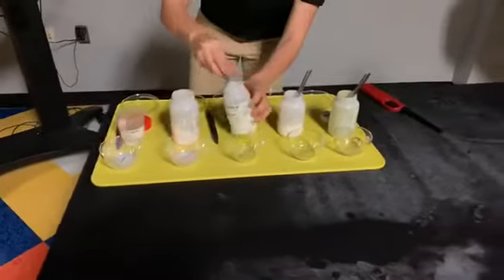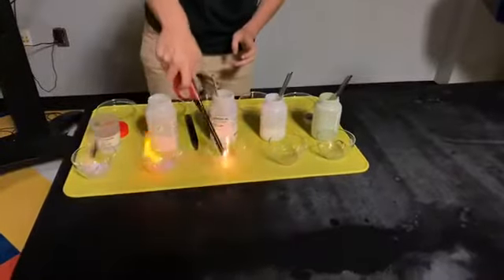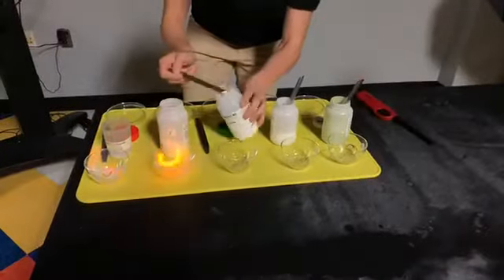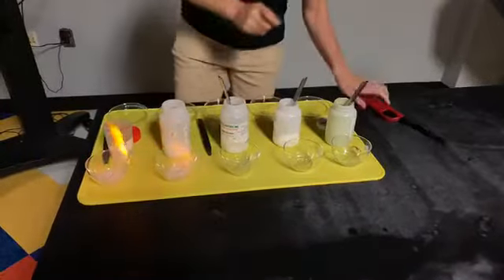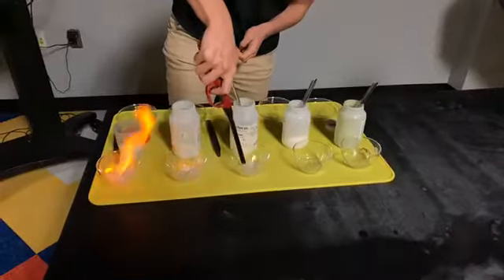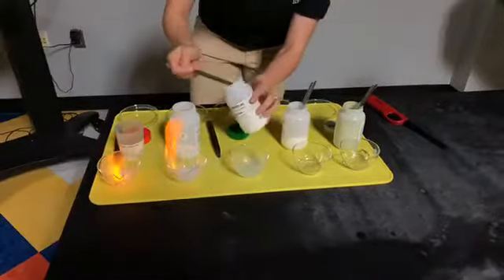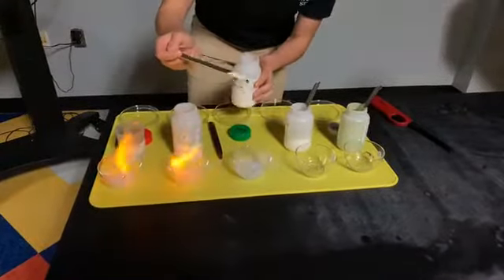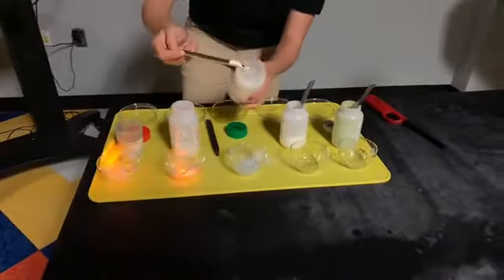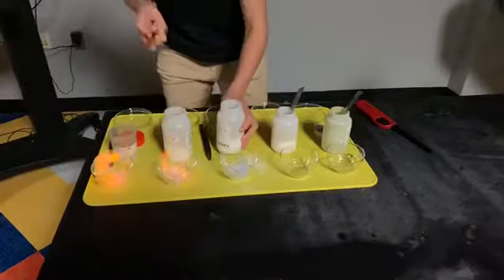And then moving on to this one, let's see if it's still hot. No, it is not. We'll light it again. Still nothing. All right, there we go. As we add this one, it's going to be a little bit more of that purplish color, that blue. Can you see that? This one is potassium chloride, and that's a really cool color.